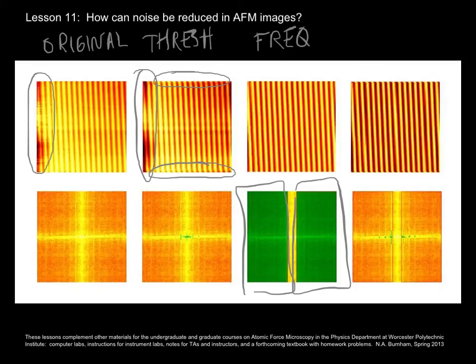So low values of inverse x for all amplitudes of inverse y. So that comes out pretty well, as you see. But if you were able to blow this up, as I have on my computer screen, you would still find some sketchy, noisy patterns right in that area.